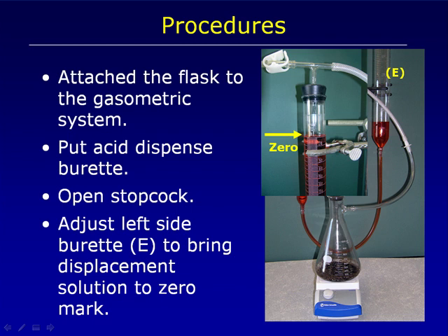Adjust the left side of the burette up or down to bring the displacement solution to the 0 mark.